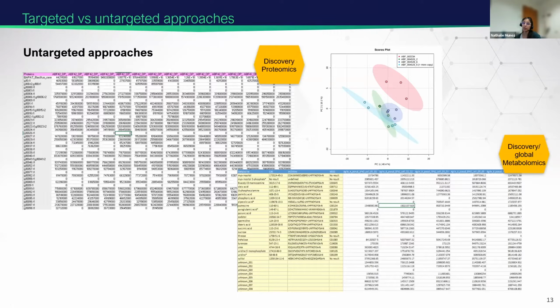We have to process the chromatograms, which requires alignment, picking, identification, meaning it's complex and requires an effort in data analysis. And also something that we need to have clear is that these are relative levels. These are not absolute quantifications, and we can compare levels of the same protein or of the same metabolite between samples. We will go in depth about this in days 2 and 3. The untargeted workflow in general is global in scope and outputs data that's related to comprehensive cellular metabolism.